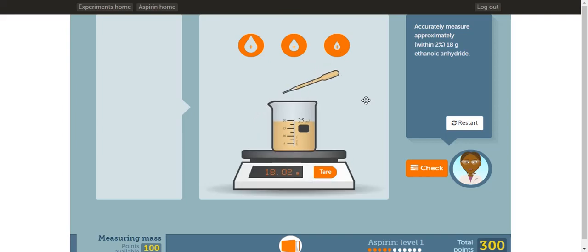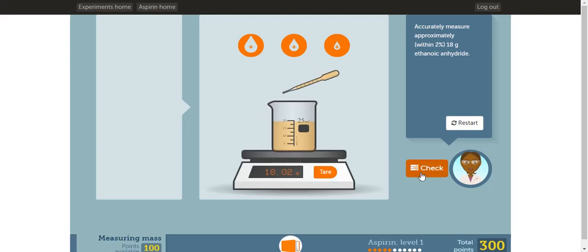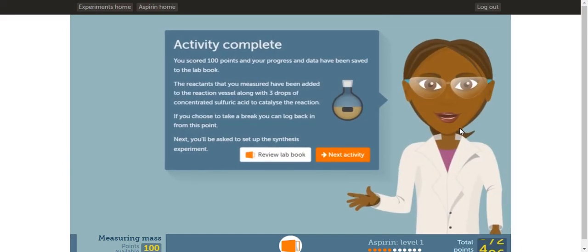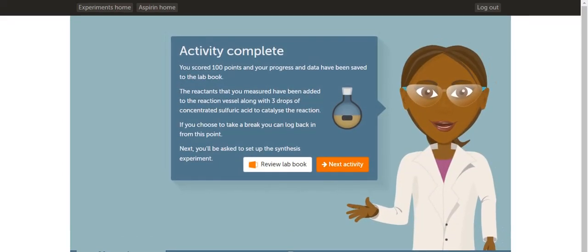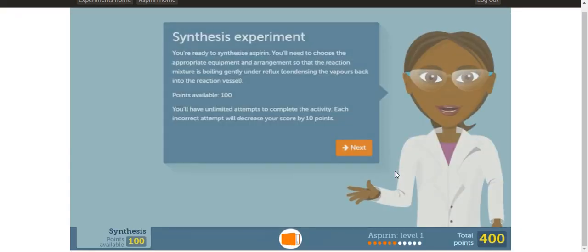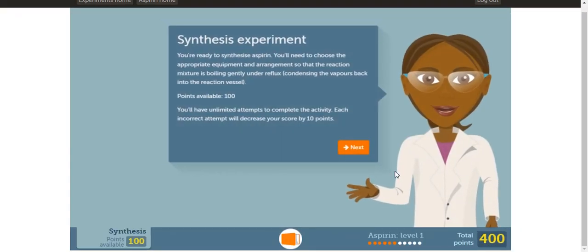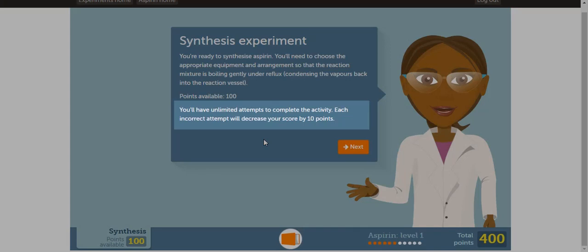Once you have about 18 grams, click check. Now that we measured the masses of the two reactants, we can now set up the reaction. Once you're ready, click next activity. Keep in mind if you make a mistake, your score will decrease by 10 points.